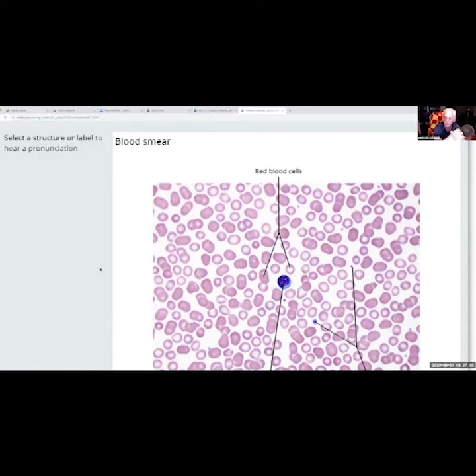So if you look at this one here, it is rotated so the inner portion, the biconcave part, is right at your face. You're looking right at it, so the edges are dark. If you're looking at this one here, it's rotated so the darker end is rotated towards you. You have to remember, you have a three-dimensional object, and you're putting it on a two-dimensional plane. Does that make sense? Yeah. Okay, perfect. It's very hard to do a lot of times. Really, you're looking at two dimensions of it.